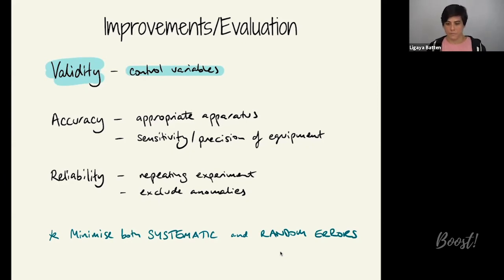So if you've got some experiment that's hypothesizing, does changing concentration affect the enthalpy of neutralisation? So for example, you could try different concentrations of acids or alkalis. Then you want to make sure that the only thing you're changing is the concentration, and everything else is staying exactly the same. The volume of water, the mass of whatever it is you're measuring, the approximate temperature change, etc.